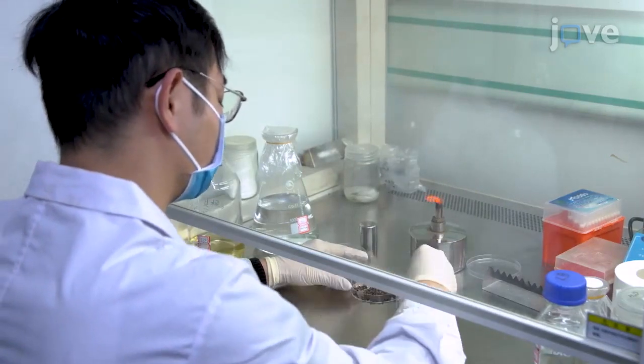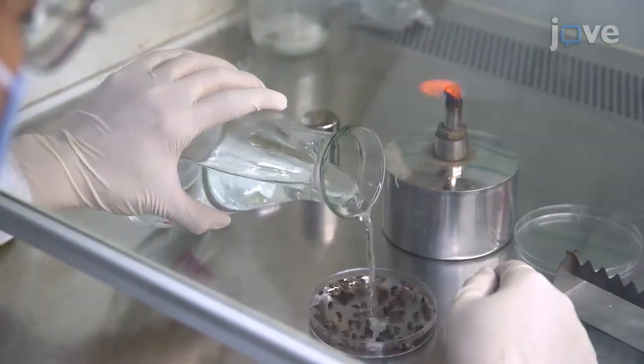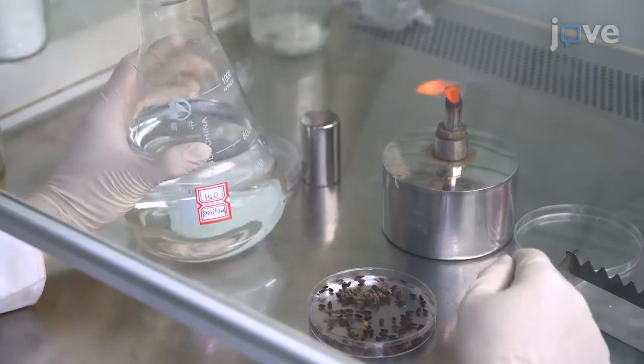Begin by selecting plump and undamaged Tartary buckwheat seeds and soaking the seeds in 28 degrees Celsius water for approximately 20 minutes.